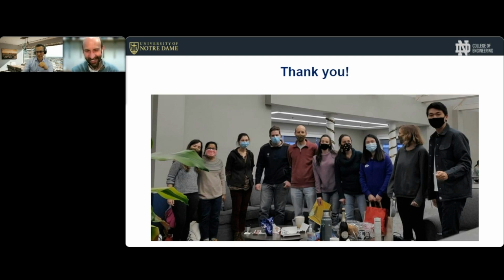Yes. I would say yes. You would probably have niches forming where different bacteria become more abundant at different locations within the biofilm, depending on the substrate limitations and the morphology. But that's very specific to the type of metabolisms that you have in your biofilm and the type of growth conditions. So I say definitely yes, there is a difference, but of course you'd have to explore that for each particular situation.